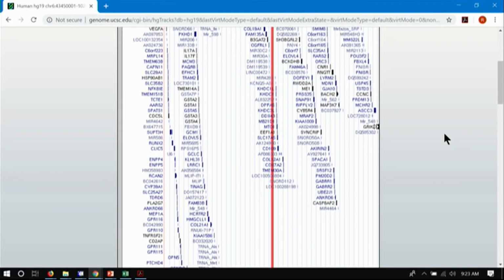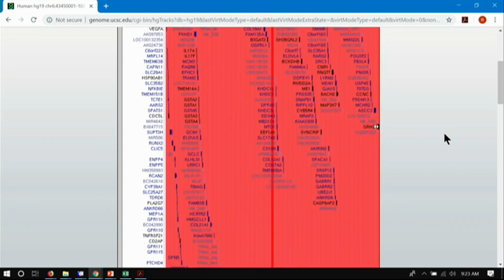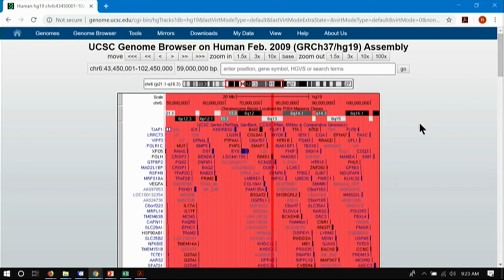Yes? I wanted to just share a quick secret I learned. I don't know what you were going to say, but you can also do that by hitting the keys HM. The keys HM. Highlight the window. It highlights your region, right. That's cool. That's good. Thank you for that.